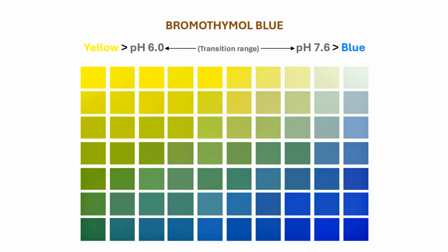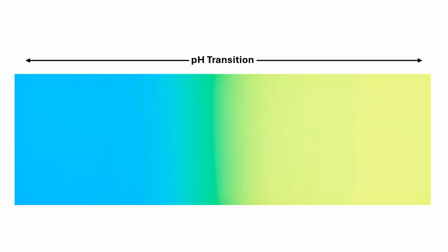The pH transition range of an indicator is the pH range within which the 2 colors above and below that range sort of mix to give a different color. This is the range where the color on one side transitions into the color on the other side of that range. This transition is visually characterized by a mixing of the 2 colors above and below that range. This behavior of certain indicators can be correlated with their effective pH range and their pH transition range as shown in the table.